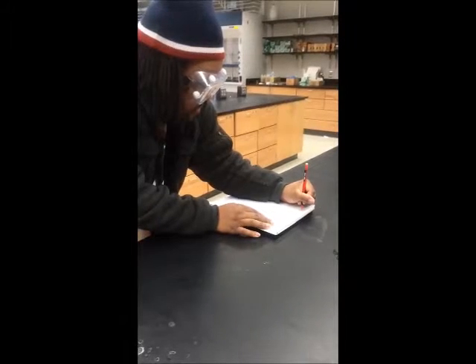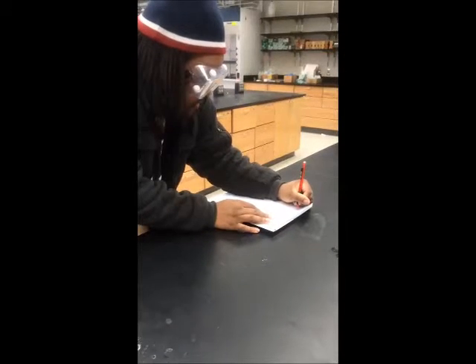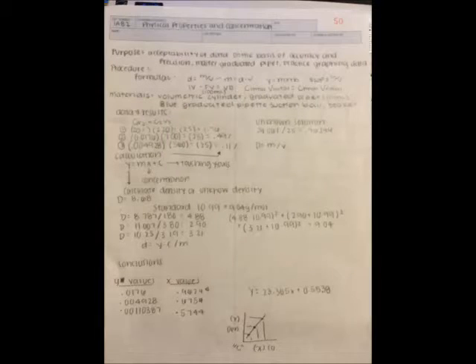Review all data collected and make sure all calculations are right. In this lab, you have collected the initial volume and final volume using the pipette and graduated cylinder. You have also found the correct mass using the analytical balance.